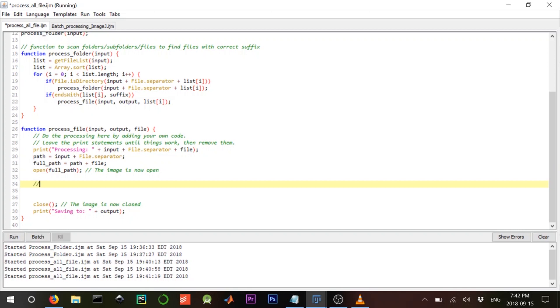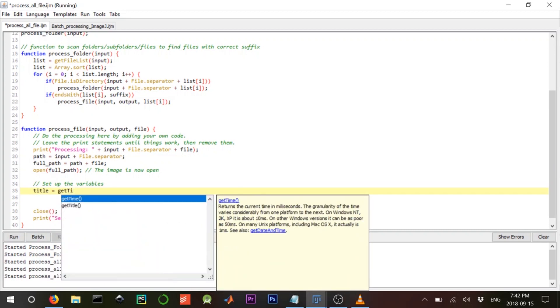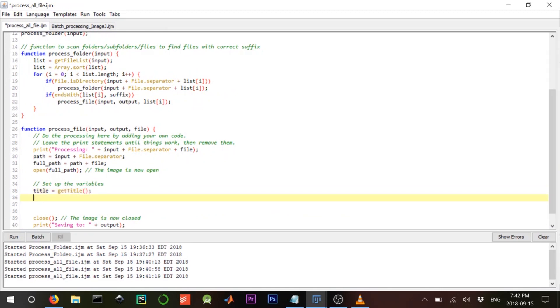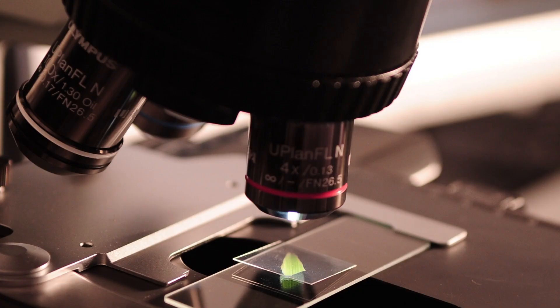Double slashes mean it's a comment, so it's not real code — I can write whatever I want to keep myself structured. We set up variables: title equals get_title, and new_title will be 'composite_RGB' plus the original title so we can differentiate them.